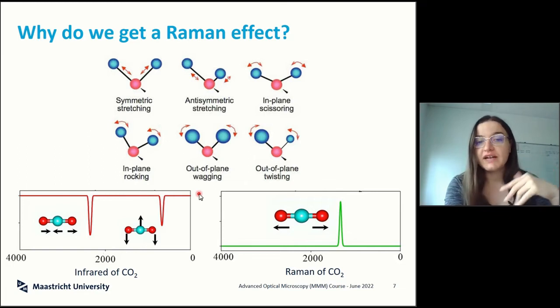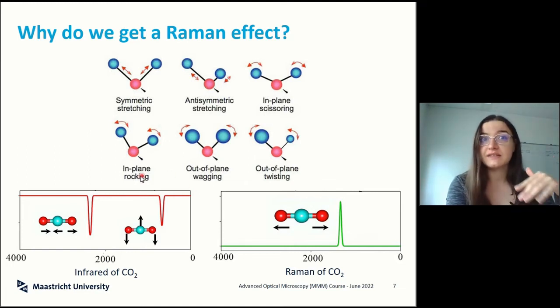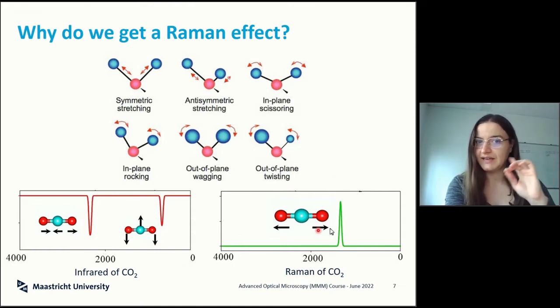They are usually regarded as complementary because there are certain signals that you can see in infrared. For instance, here you can see the transmittance of infrared with CO2 versus the absorption at a certain shift for Raman. So these things are on the same scale, and you can see that this signal is actually not here, but it appears if you go in Raman.